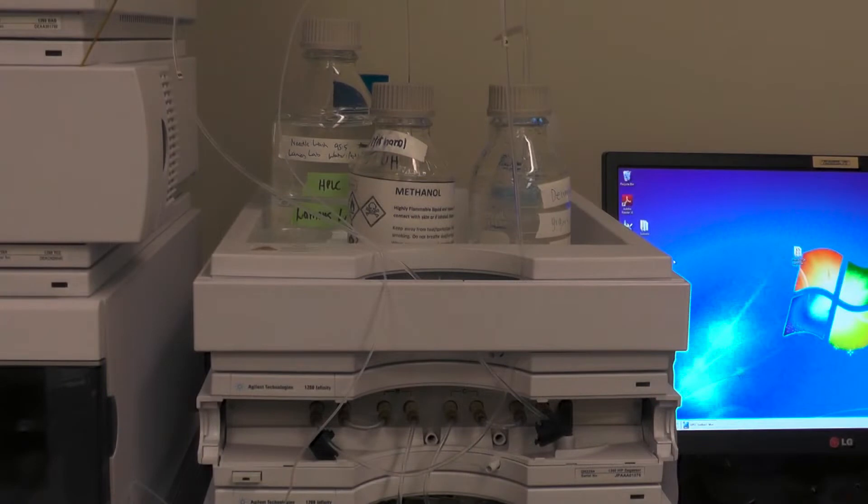The solvent pump used in our facility is a binary pump that allows two different solvents to be pumped in at once at variable proportions to achieve optimal mobile phase polarity.